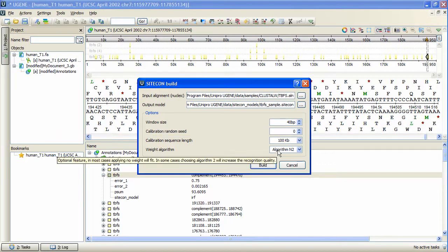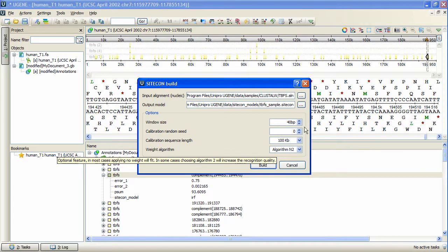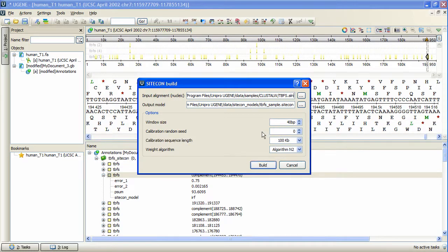Also, calibration options are available to set. When done with the options, press Build.